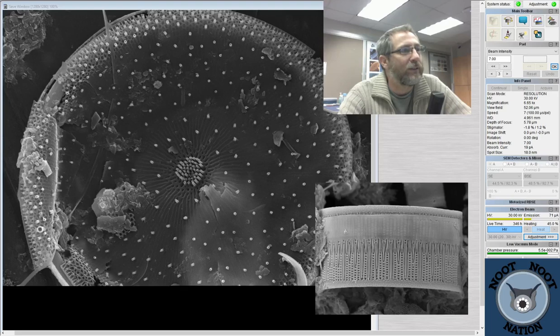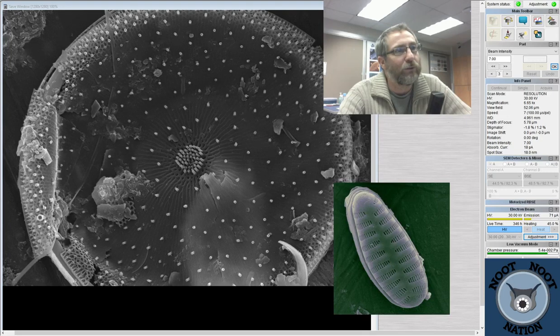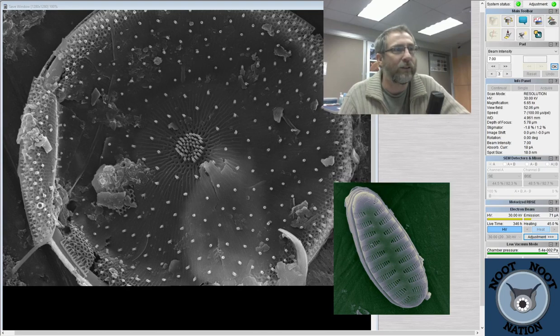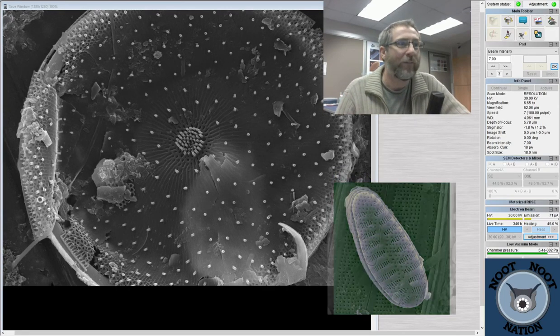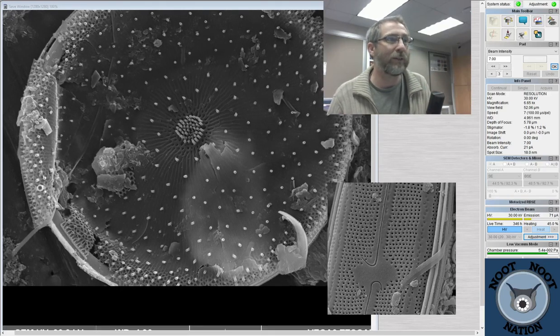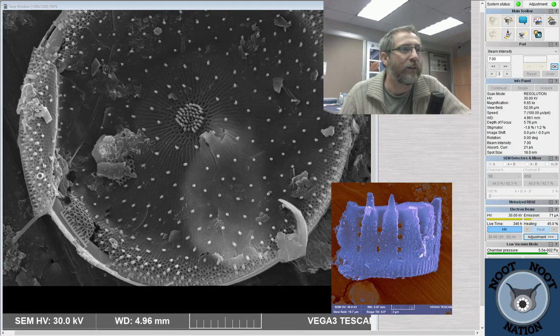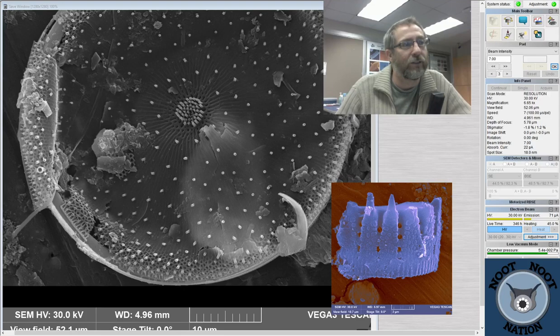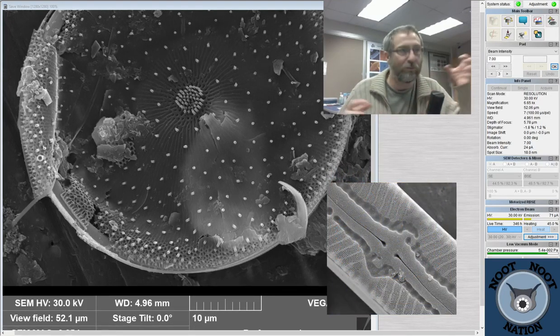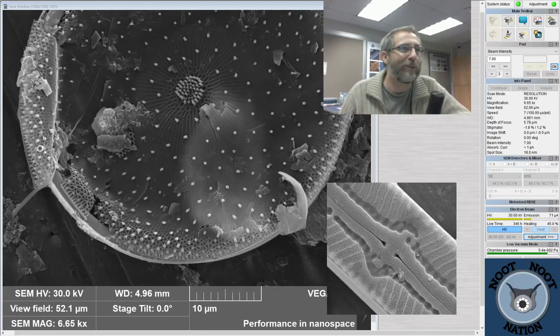maybe they just function better as a colony. I don't know. They oftentimes will make long colonies to avoid being eaten. If you're small and you fit in something's mouth, you get eaten. If there's two of you, you're twice as big, or 10 times as big if there's 10 of them, and it's really much harder for something to stuff you in their mouth. I think that's one reason why a lot of diatoms make colonies, because they don't want to get eaten. And by making themselves much bigger and expanding out laterally, it's harder for things to jam them into their mouths.